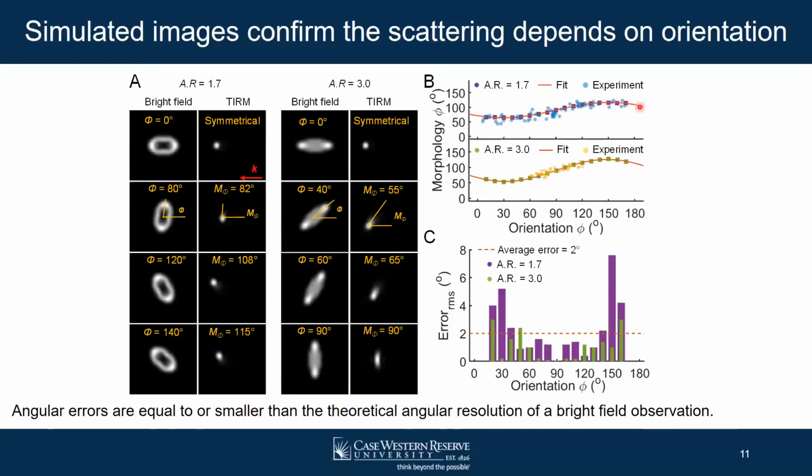What's nice about the simulation tool is that we can have much lower sensitivity to picking up scattering. Again, I'll mention this near the end, but we can pick up these kind of blind regions that we didn't see in the experiment in the simulation. So angles lower than 60 degrees and higher than about 120 degrees for the high aspect ratio ellipsoids.